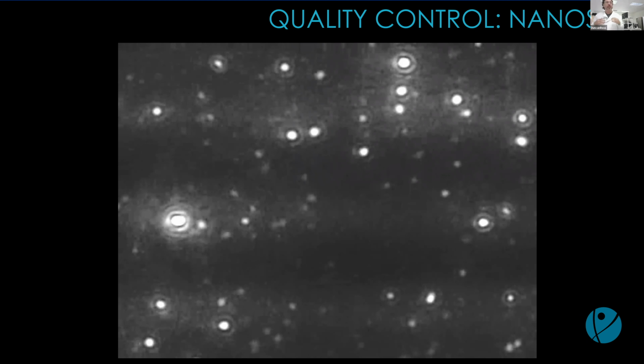So we started to get very nervous, and we wanted to try to prove those CD63, CD81, CD9 that I showed you before by flow cytometry. So, these things don't happen overnight, getting these assays going. And we were starting to get more and more data convincing ourselves that we had what we needed. But then we started to have competition come saying we have more exosomes, meaning particles, than Kimera.